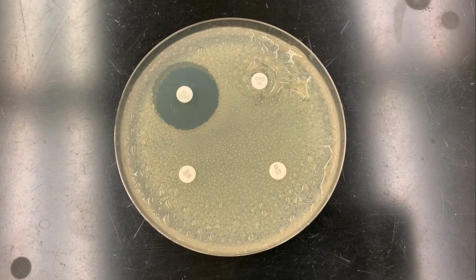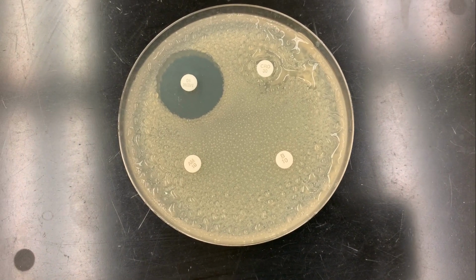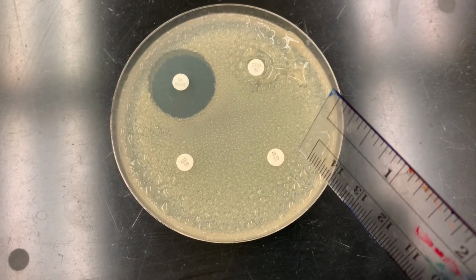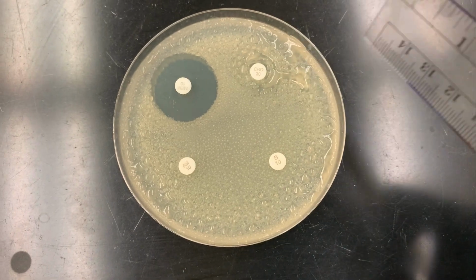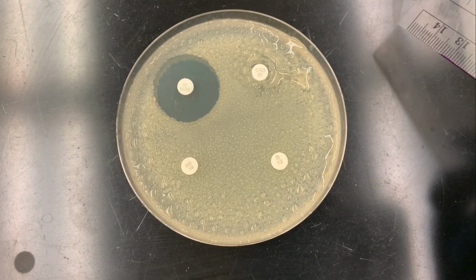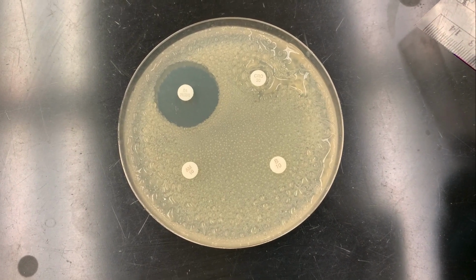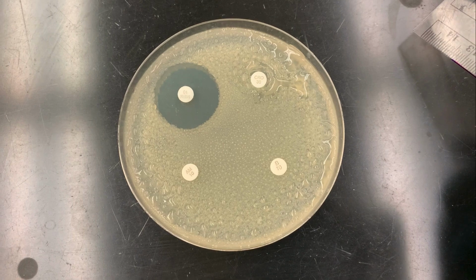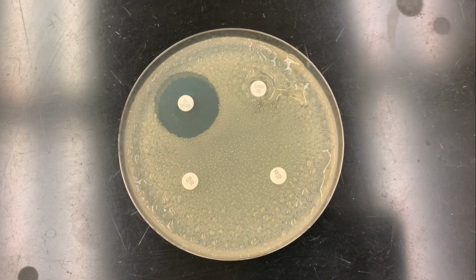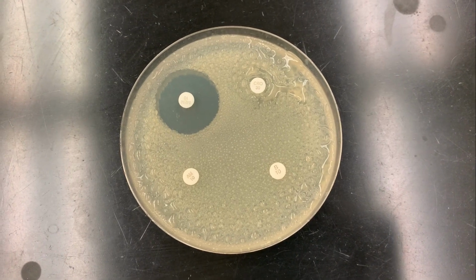So I will take my ruler and measure the zones of inhibition. What we can see, interestingly enough, is that with ampicillin, and with bacitracin and with ceftriaxone, there is no zone of inhibition. The bacteria were able to grow all the way up to the disc. What this means is that this strain of bacterium is resistant to ampicillin, bacitracin, and ceftriaxone.